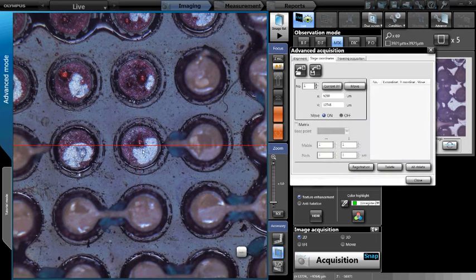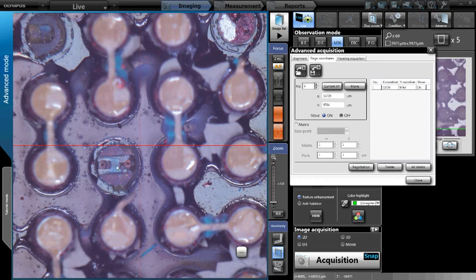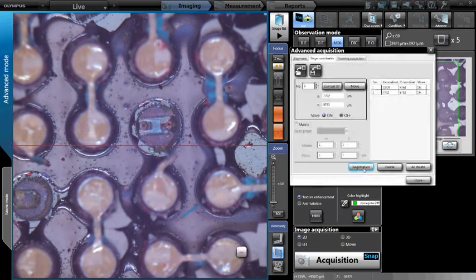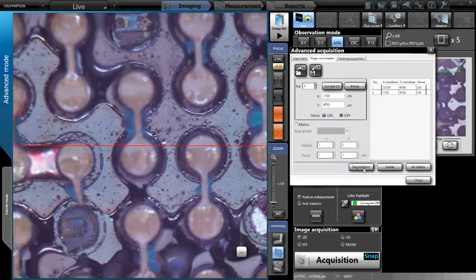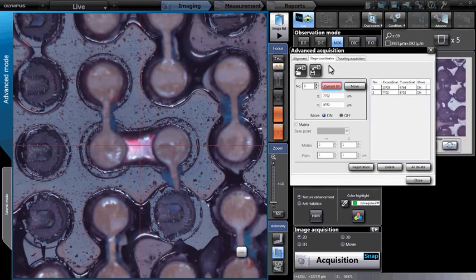Double-click to center on the first inspection point. We will now select Current XY to read the values of the first point. We then select Registration at the bottom to create our first point in the list. We will now move the stage using the joystick to the second point of interest on the sample. Once again, we will read the current XY position. We will select Registration to add the second point. Now we will move to our final point for this example using the joystick. Select Current XY again to read the position. Now we will register our final point.